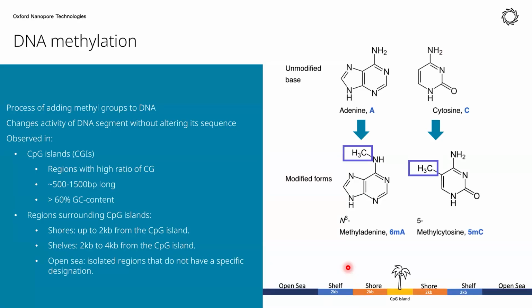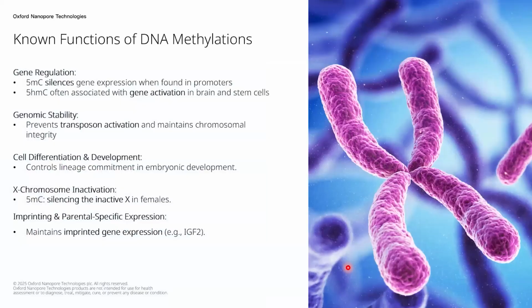Yeah, I think we can go from there. As you may be aware, DNA methylation, things like 5-methylcytosine, is often used in the genome for modulating gene expression.